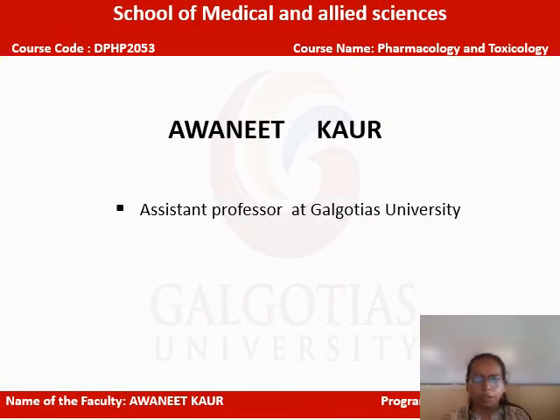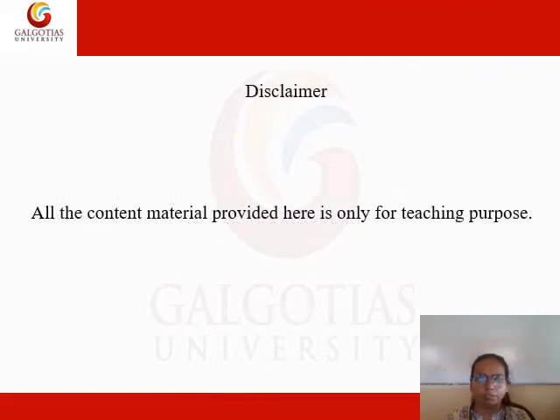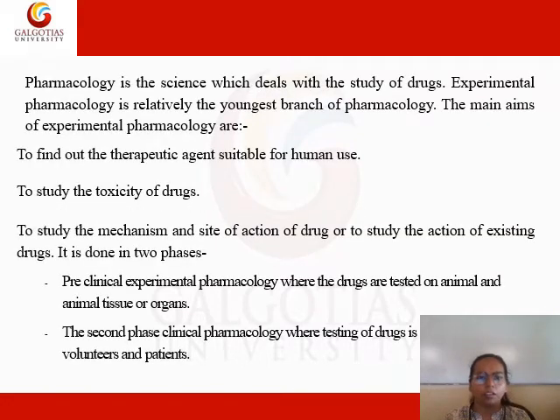Today I am going to introduce experiment number 1: to study the various instruments and apparatus used in the laboratories. Pharmacology is the science which deals with the study of drugs.